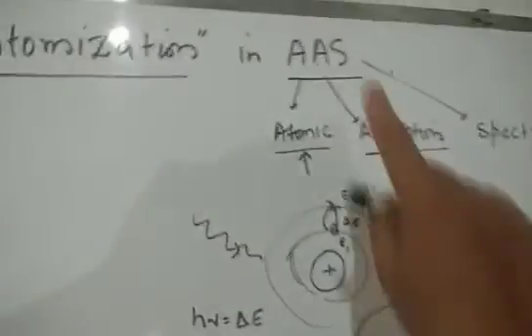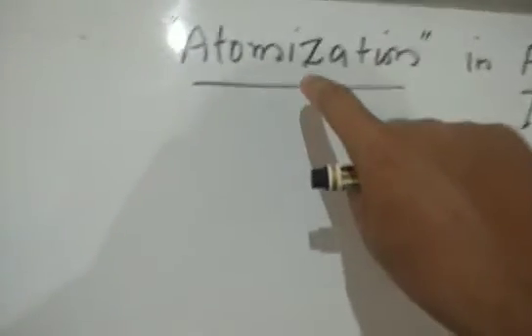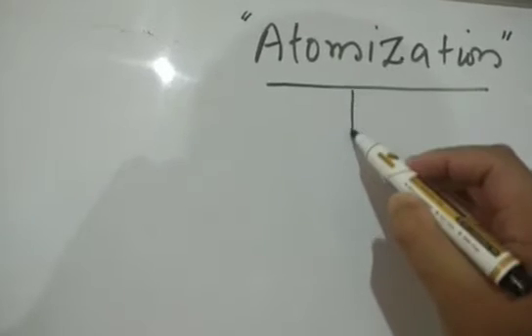Now, इस atomic absorption spectroscopy में एक process है that's called as atomization. तो ये basically हमारा topic है atomization.